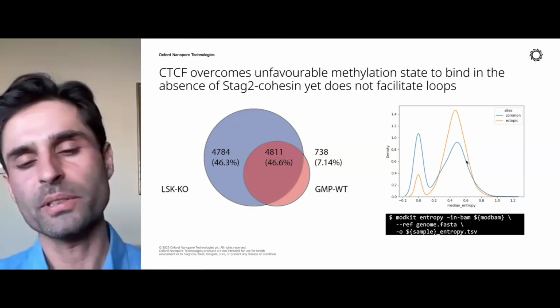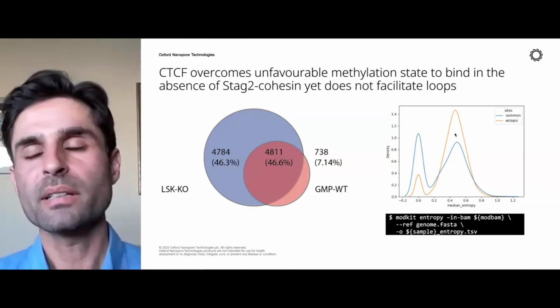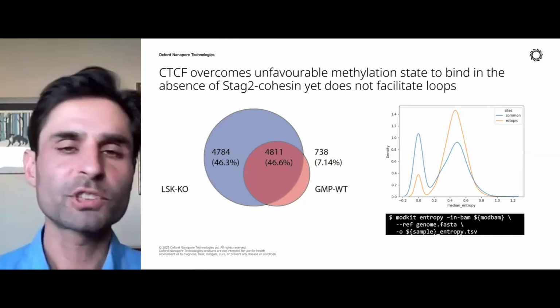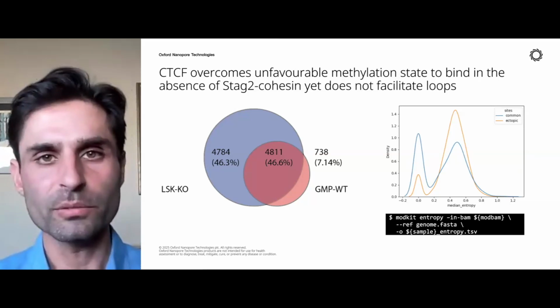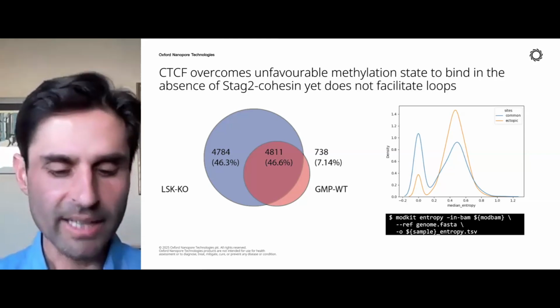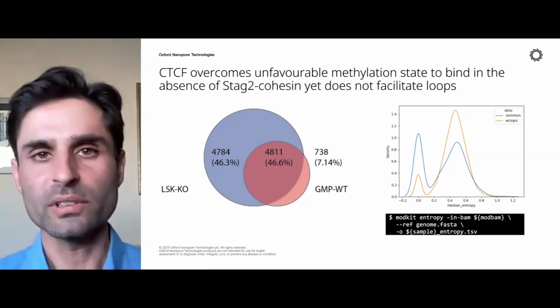And so what you can see is this bimodal distribution of the ectopic sites having higher methylation entropy, which is something you might want to investigate, because that might lead you to think that there's more change and dynamics going on in those places, because across all of your reads the methylation is not ironed out. Each one's a little bit unique.